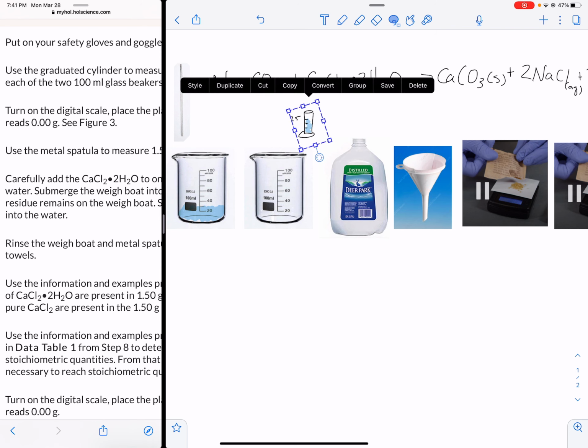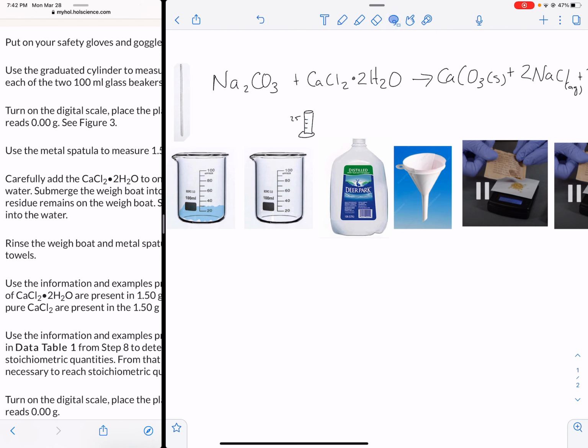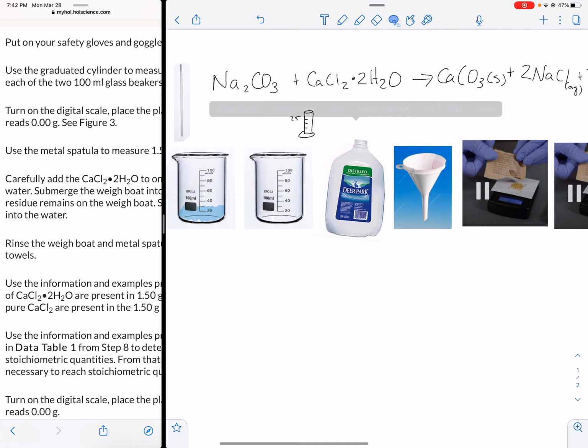I know it looks like I've got water in there, right? So once it's gone, bring it back up here. Give me some more water so it's filled up. And I'm going to pick it up and put that in that section. So I'm going to have 2 beakers by the end of this step that have that water in them.